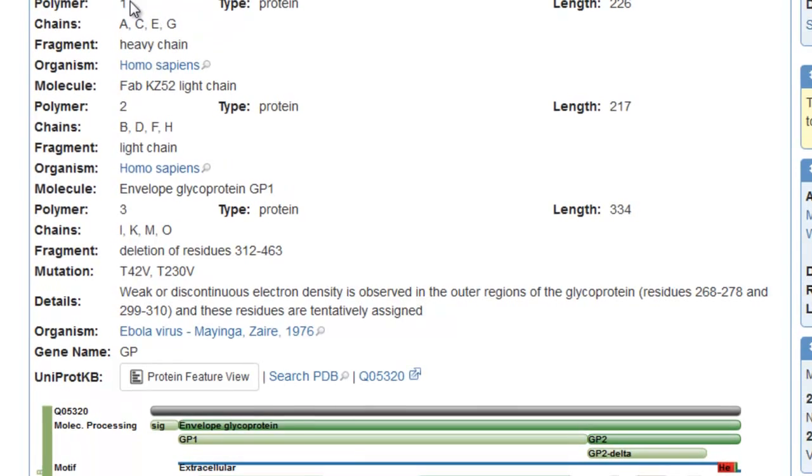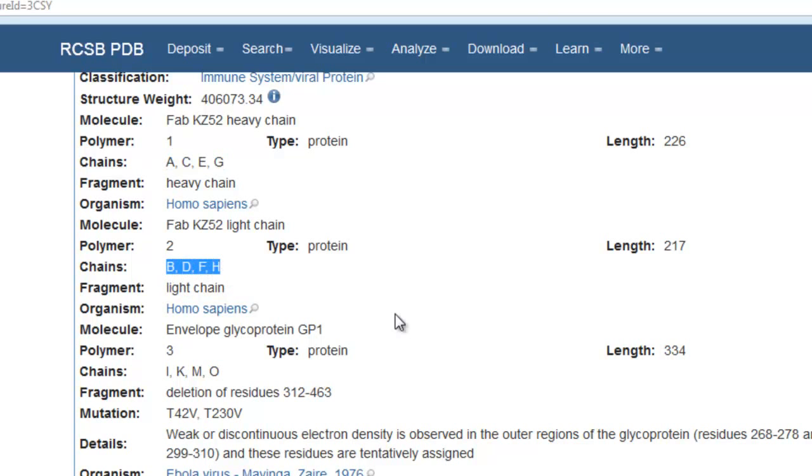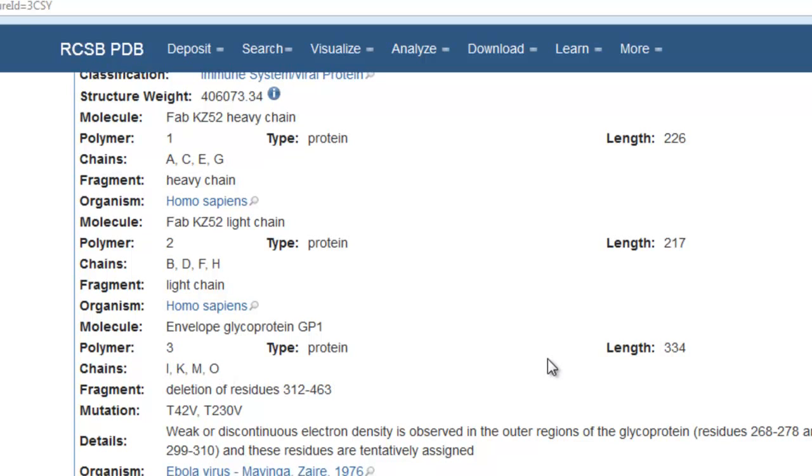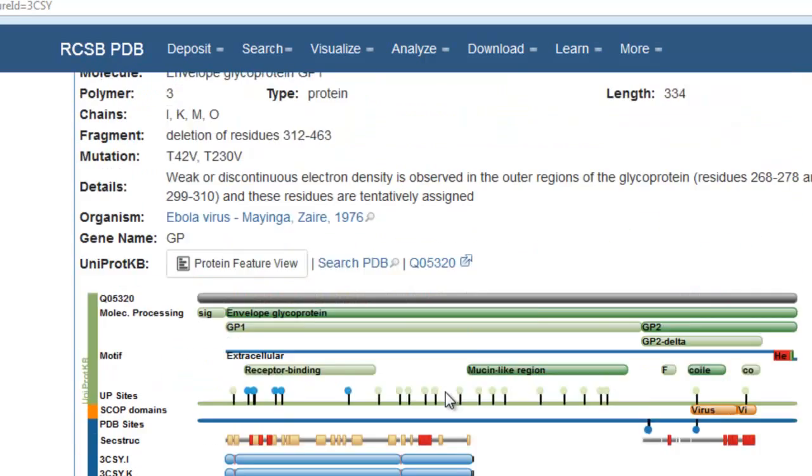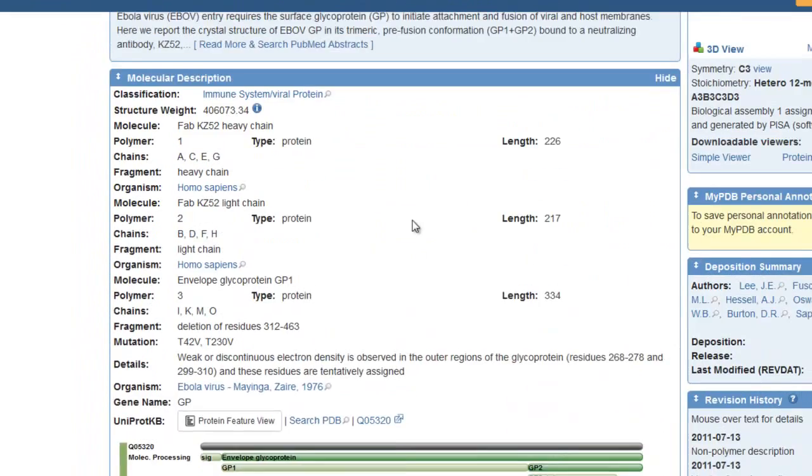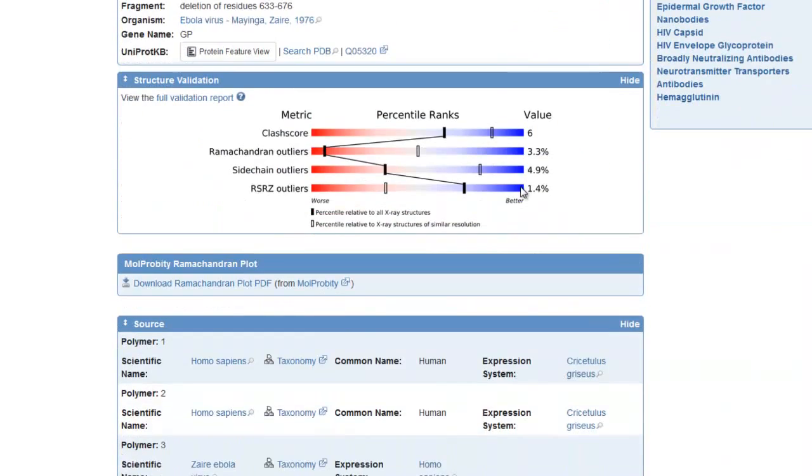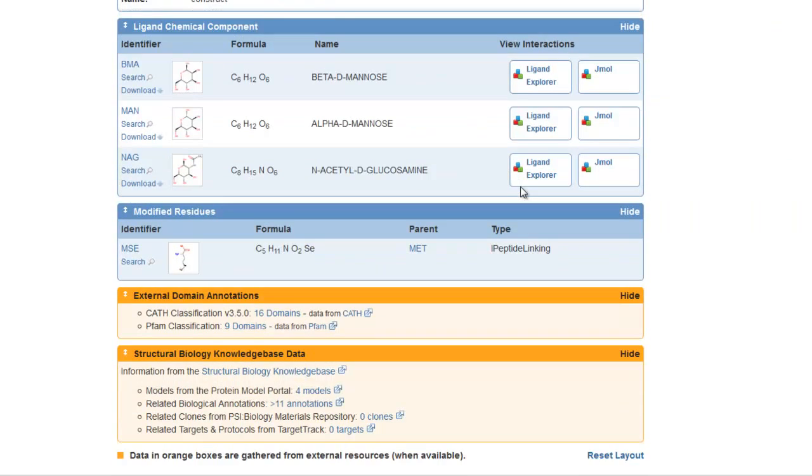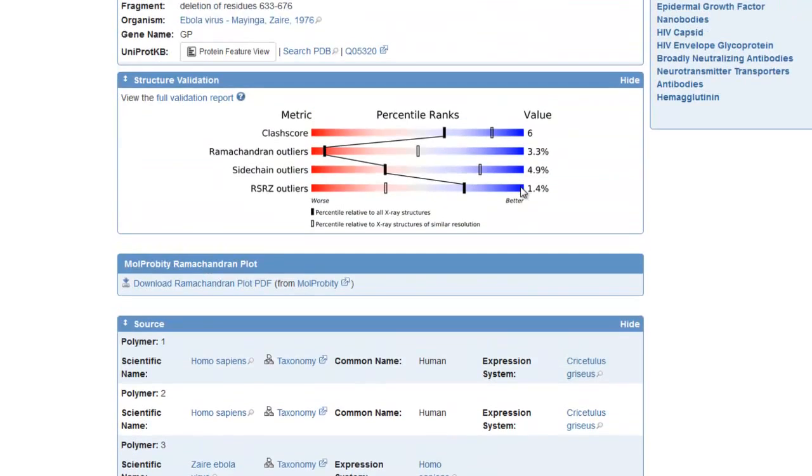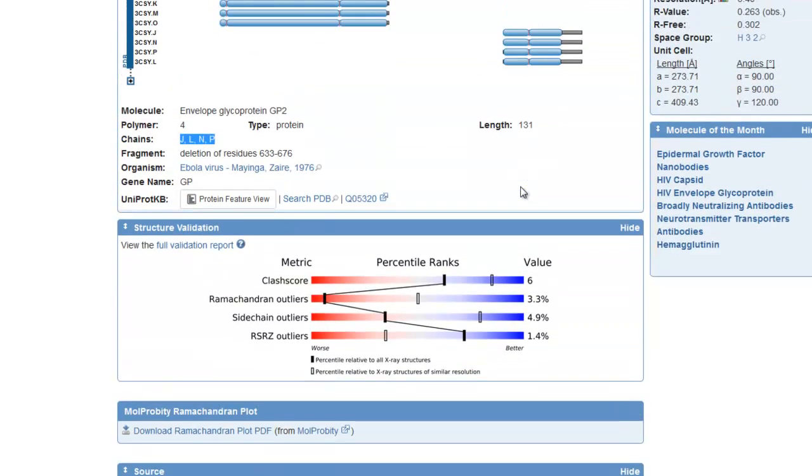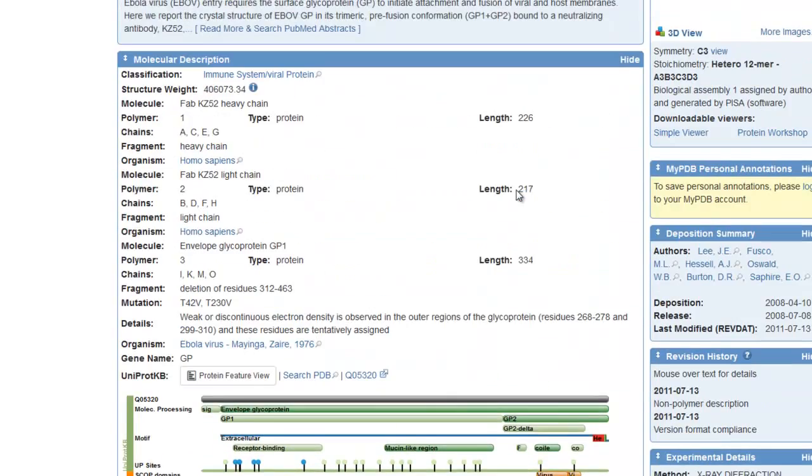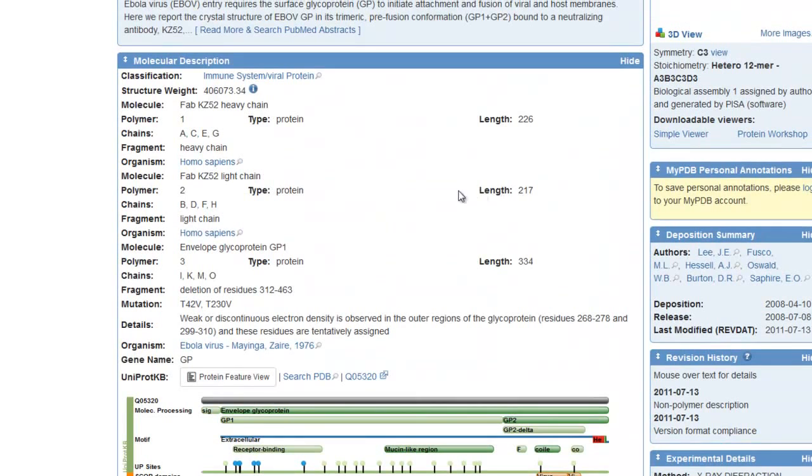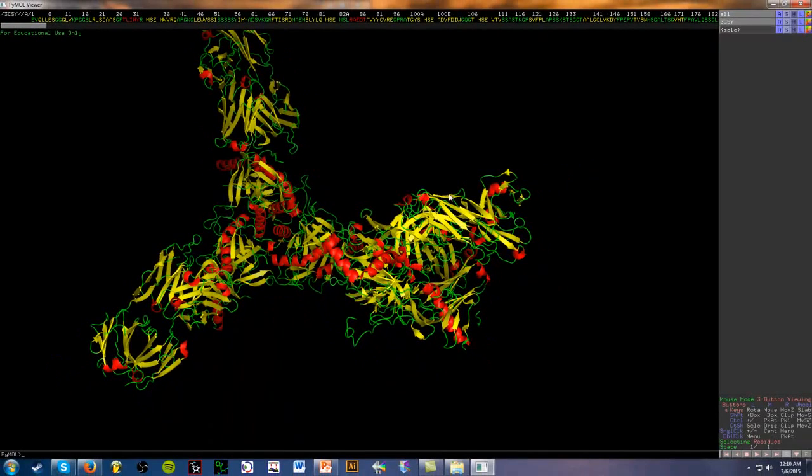For example, the FAB heavy chain is made out of these four chains: A, C, E, and G. This here is the light. These four are the GP1, and these four are the GP2 domain of the Ebola glycoprotein. There are a lot of other information, a lot of good information displayed here as well, but all this stuff here is definitely out of the scope for this video. I might discuss this later on, but right now we're not going to worry about that. So now that we know what these are, let's try to identify them in the structure.